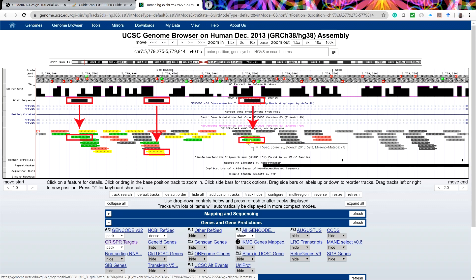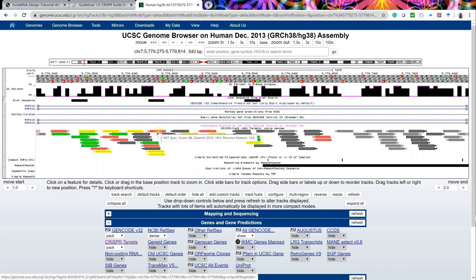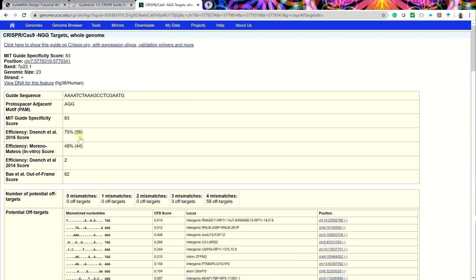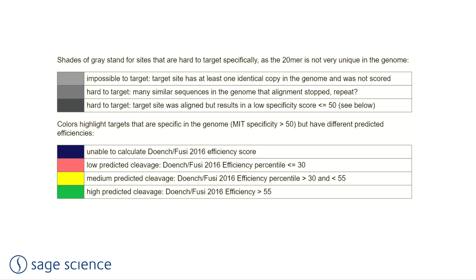By hovering a mouse over the guide, the MIT specificity score can be used to select guides with values closer to 100 preferred. The guides can be clicked to retrieve the sequences and for a more detailed view of the efficiency scores. Here is the color reference table. Remember to select two or three guides for each side of the region of interest.